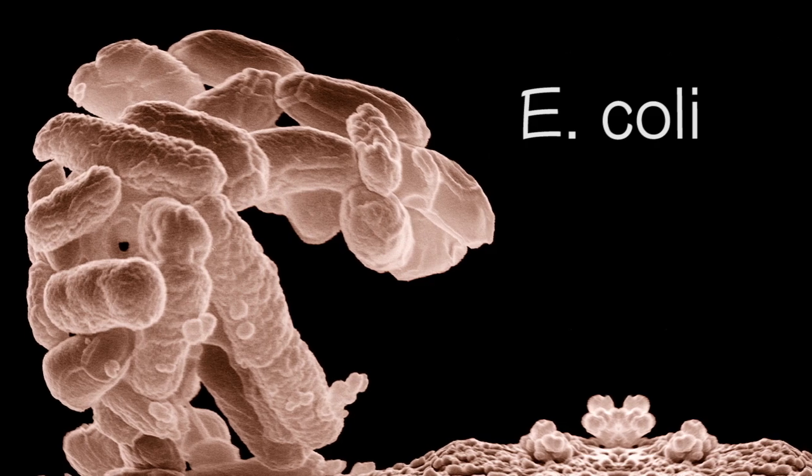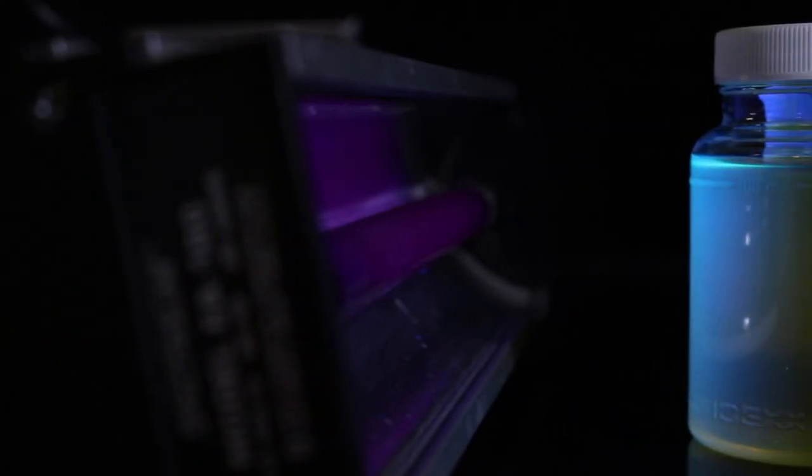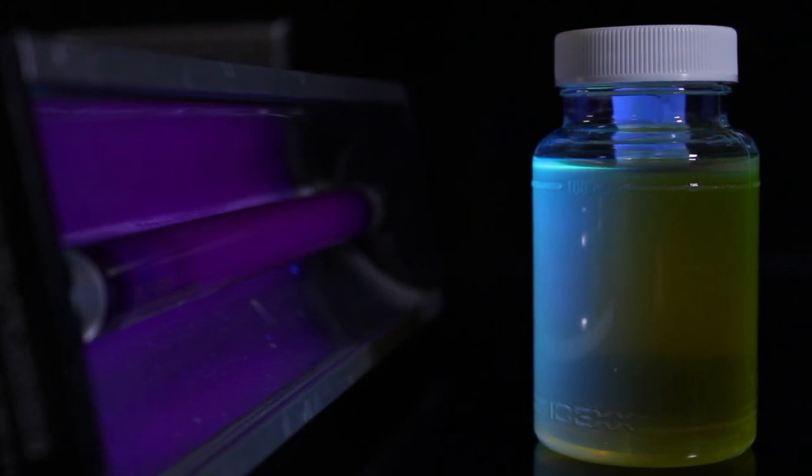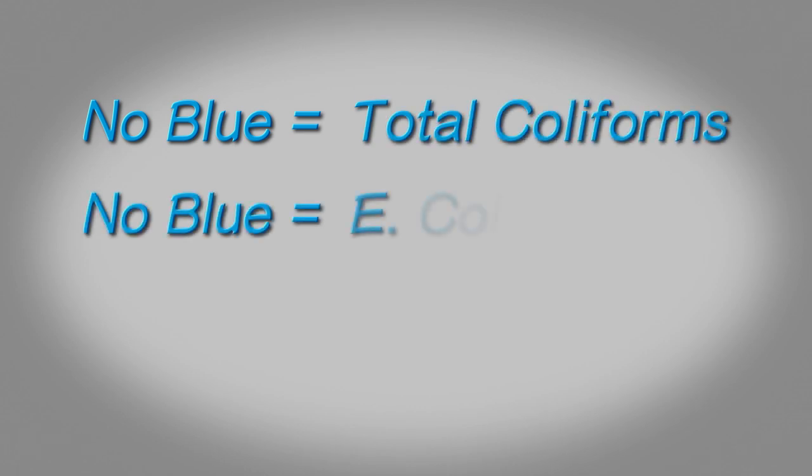To make this determination, we take the same unopened vial that produced a yellow color with the MMO and place it under a UV lamp. No blue color means the sample is positive only for total coliforms and negative for E. coli.